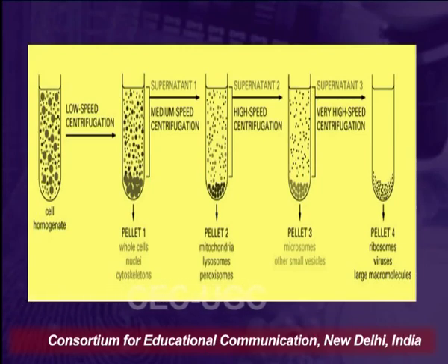We continue until we reach a point where we are looking for a specific kind of pellet or supernatant. We can have multiple rounds of centrifugation, increasing the speed, lowering the speed, or changing the buffer, which will help us reach the perfect stage where we are looking for a specific cell, specific organelle or specific nucleic acid. Depending upon whether you are extracting DNA or RNA out of the biological material, the buffers will differ, the revolutions per minute will differ, and the centrifugal force will differ, depending upon your target.